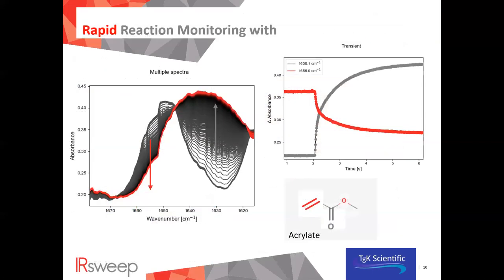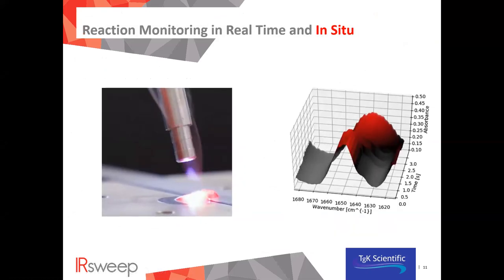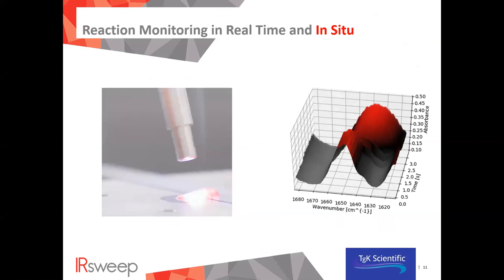We reported previously on rapid reaction monitoring. Now, this is a really nice story. We already had 150 spectra per second, that was at the beginning of the year, just in January. You see here the possibility when you initiate such a reaction with UV light. That's the glue hardening. It's actually polymerization in the end. And this reaction takes place in 2 or 3 seconds.